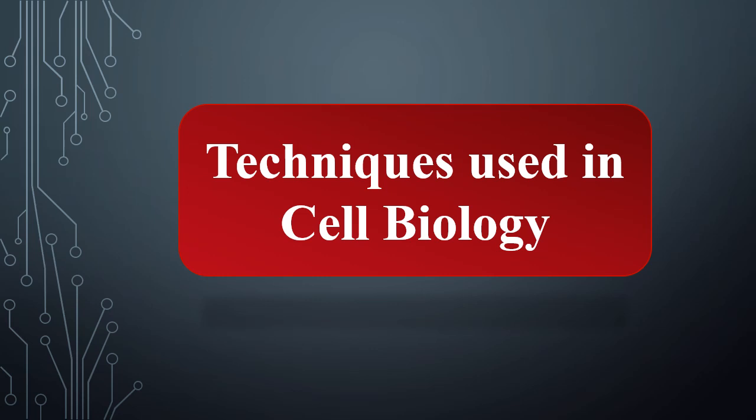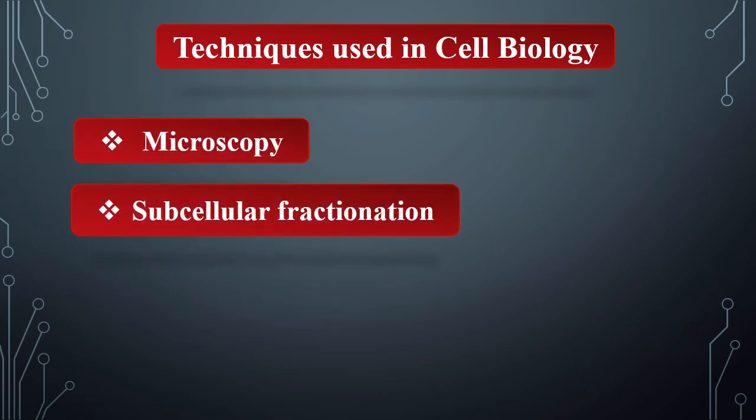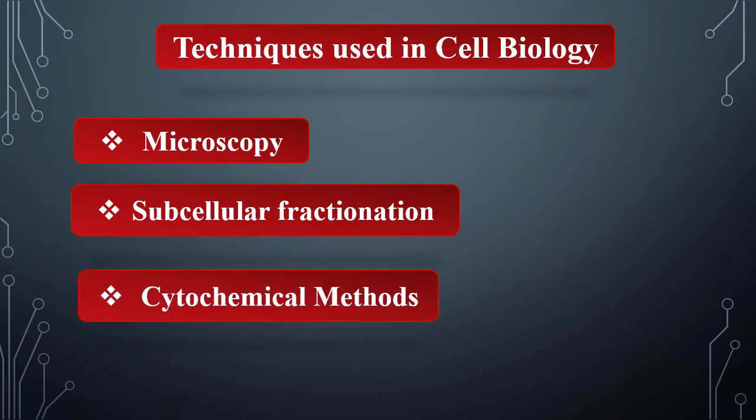Hello, today we are going to see some techniques used in cell biology. Some of the techniques mostly used in cell biology are microscopy, subcellular fractionation, cytochemical methods, and cell culture.